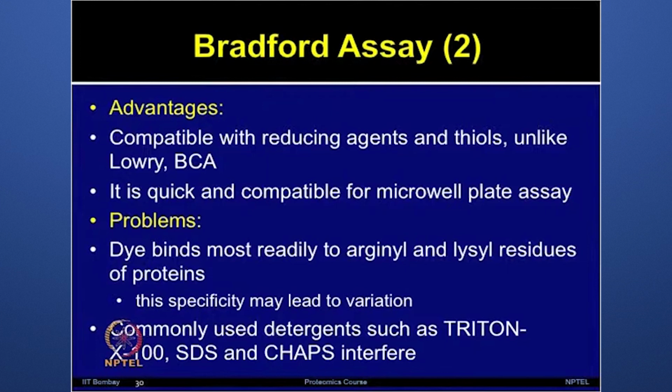But there are different problems with the Bradford assay as well, such as the dye binds mostly to the arginyl and lysyl residues of the protein, and this specificity may lead to variations. Now, there are various detergents such as Triton X-100, SDS and CHAPS.